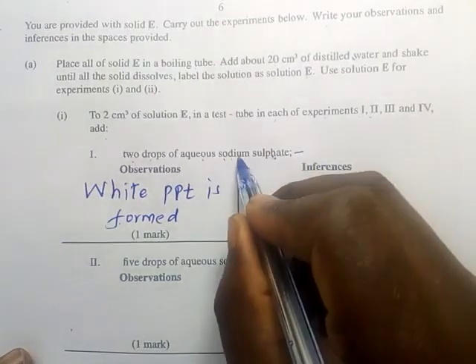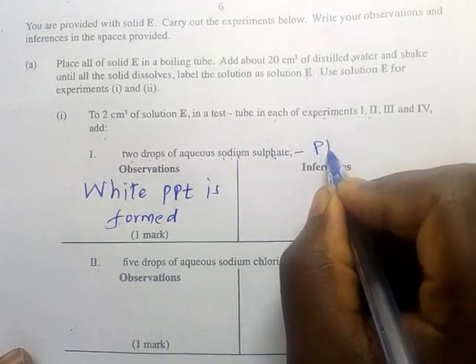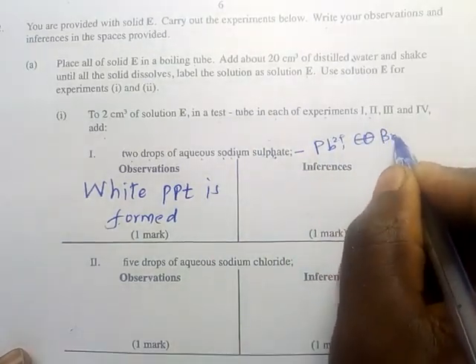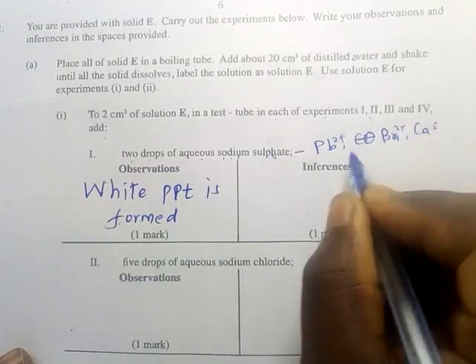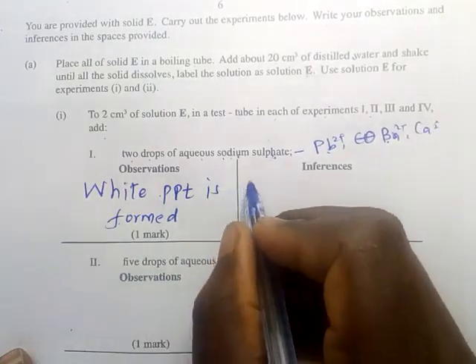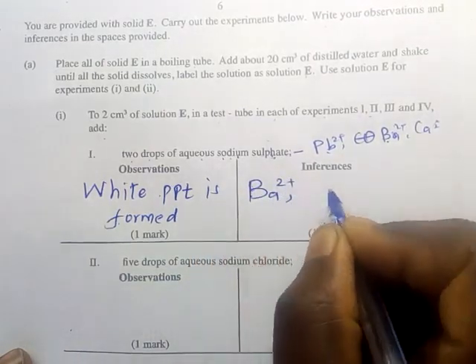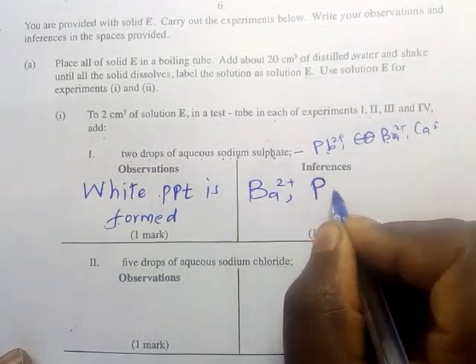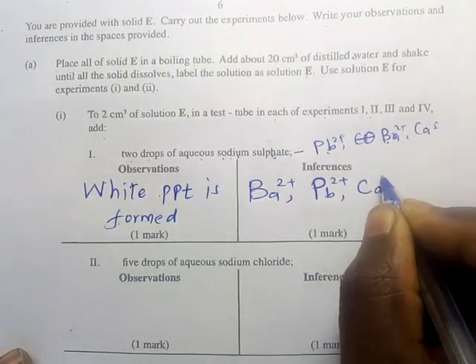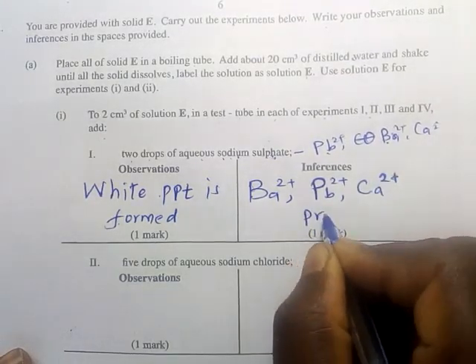Remember, the sulfate ion, if it finds the lead 2 ions, the barium and the calcium, they will form a white precipitate: lead sulfate, barium sulfate and calcium sulfate. So this means that barium 2 positive, comma, lead 2 positive or calcium 2 positive is present.